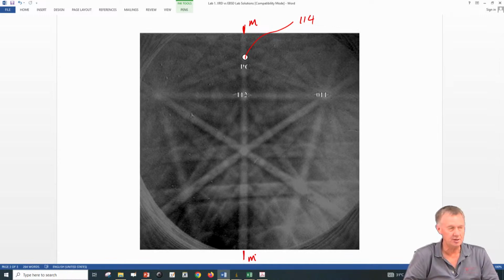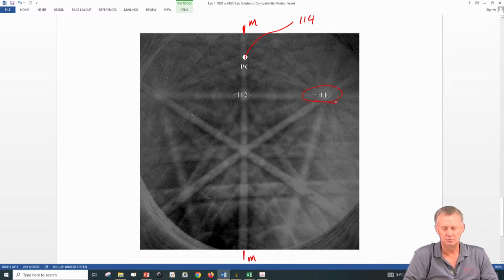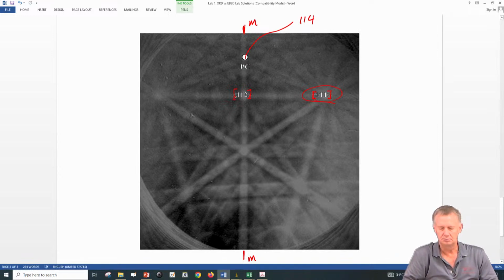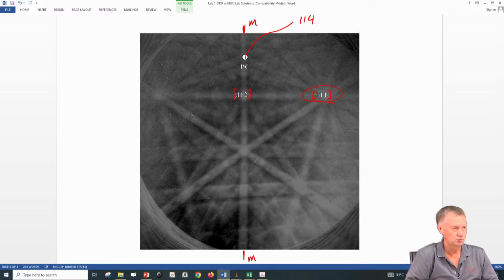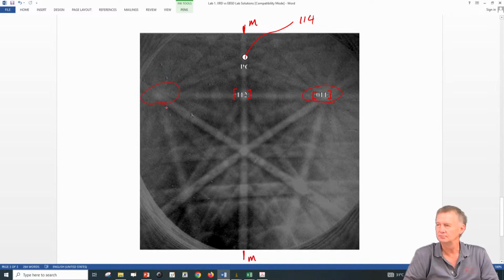What does that tell you about the pattern? We have one zone axis that's off of that plane, right? That's that 011. And I put those as pointy braces, but I should have them as square braces because I'm going to insist that we have the right ones. So if that's a mirror, then this 011 has to be the same family as this one over here, right? Okay.